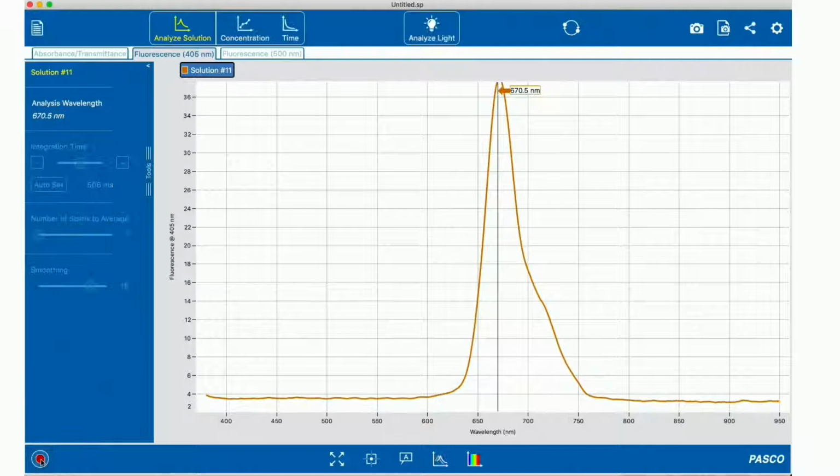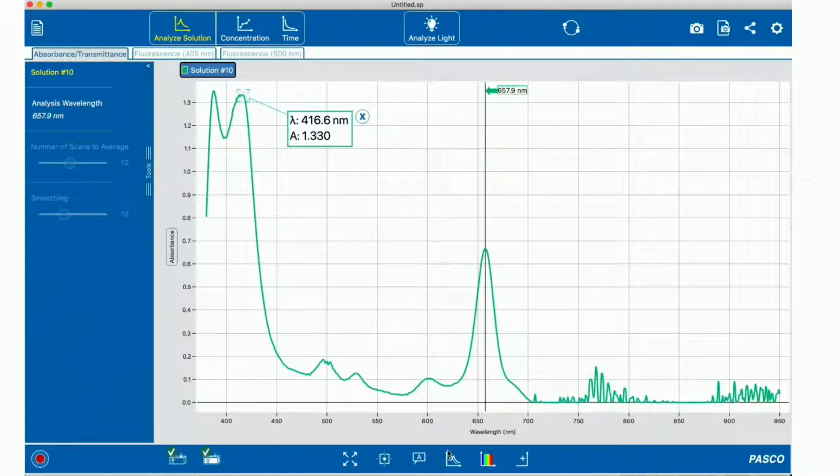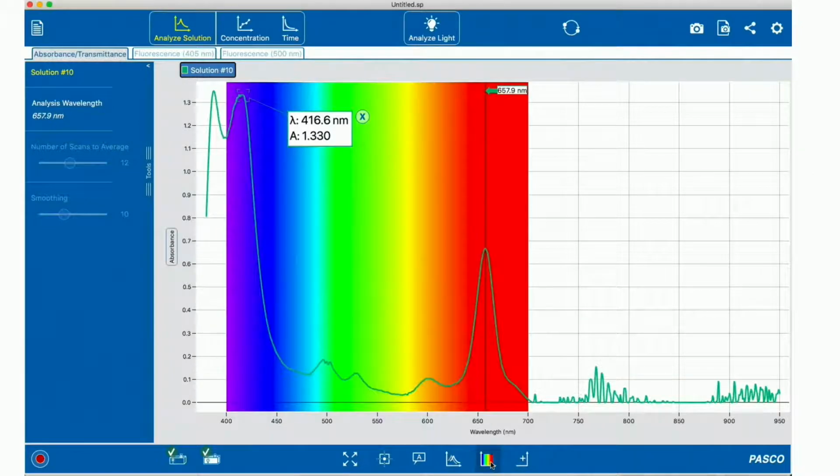We can map that. We can track that. We can even use that for concentrations, apply Beer's law for those of you who might be doing that. And let me flip back here. Let me show you where those colors are, because you might be thinking, what colors am I looking at? So go back to my first spectrum and bring those colors in so you can see that we are definitely absorbing at the blue and at the red, which means we're transmitting at the green, which is why our leaves are green. Because they absorb the blue, they absorb the red, but they transmit in the green, and that's why our leaves are green.